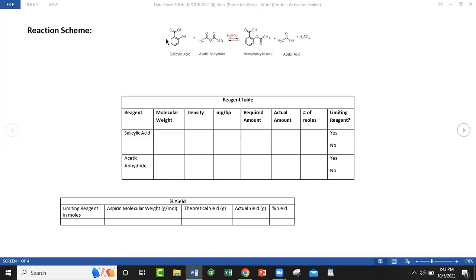And let me say this too before we start. With the NMR and the infrared, those labs are actually functional, and I want to do those in person. So I'm going to break y'all up into groups, and it may take more than two groups, but we'll come and do those experiments. The NMR is a very good experiment, and the instrument was close to $275,000, I think.